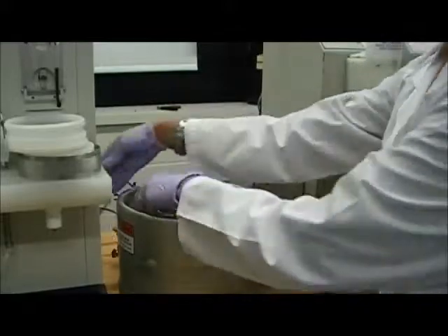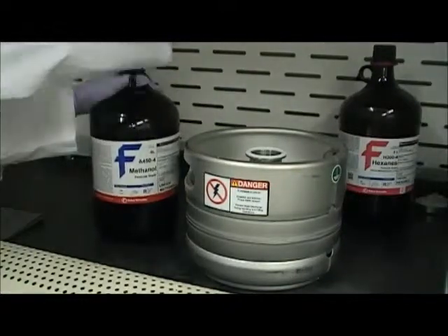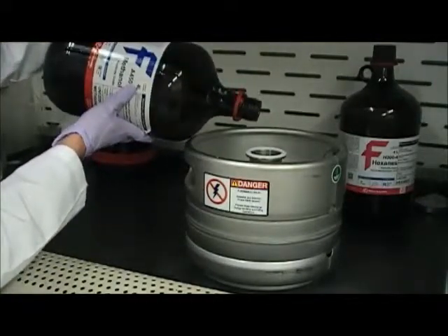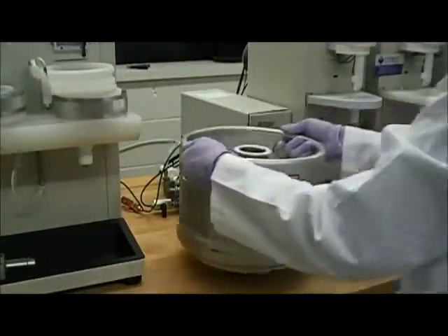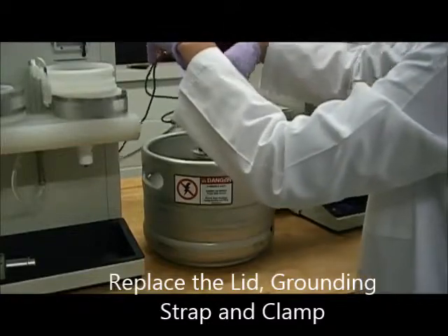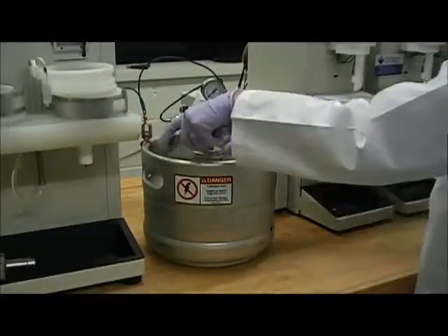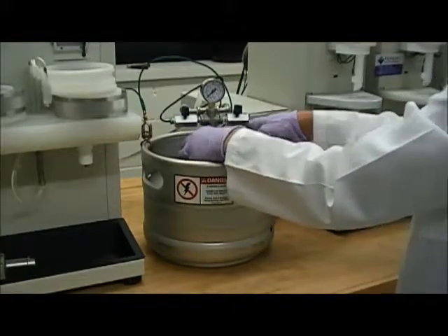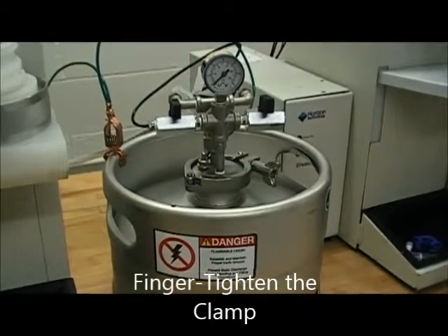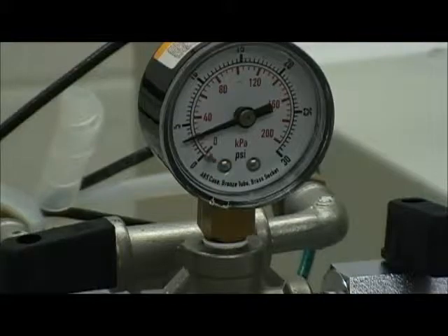Remove the grounding strap only if you're going to be moving the canister to a hood that's not right next to the instrument. Carefully pour solvent into the canister until it is almost full. Place the solvent canister next to the instrument and replace the top, immediately putting the grounding strap back onto the canister. Then place the clamp onto the canister and finger tighten. The pressure should be set to 15 psi.